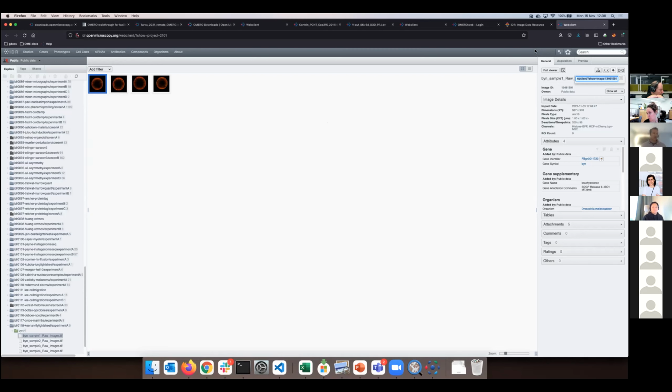We used to have the concept of share, which we have disabled for various reasons, but we're now working on another mechanism to put data in the cloud, where you will be able to have this type of limited access to a set of people. So that's kind of another way of making your data public, but to a limited set.